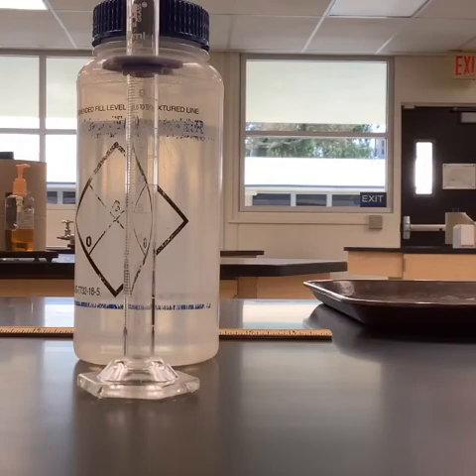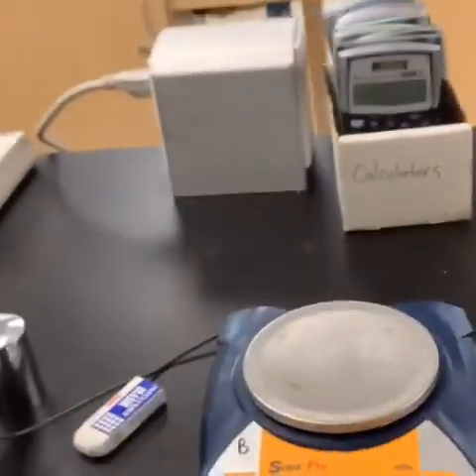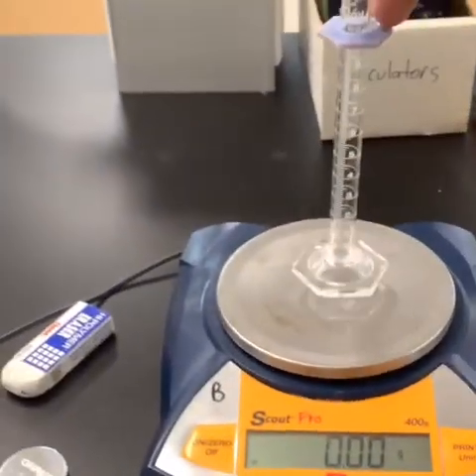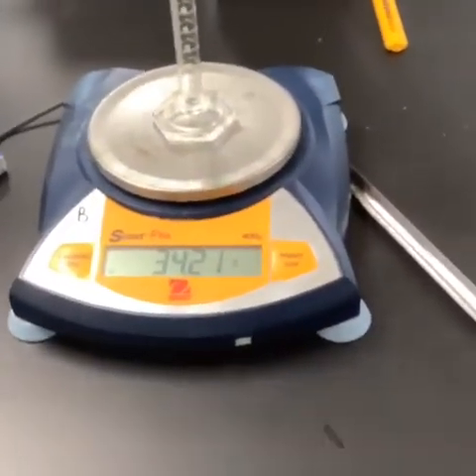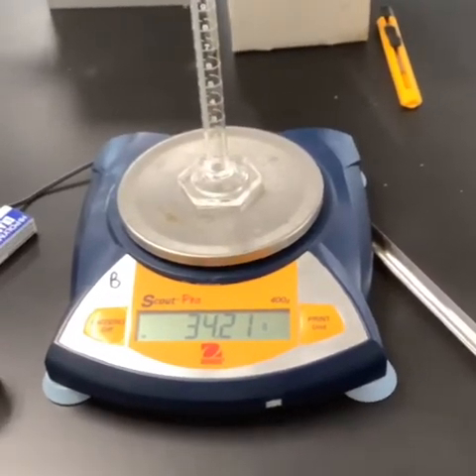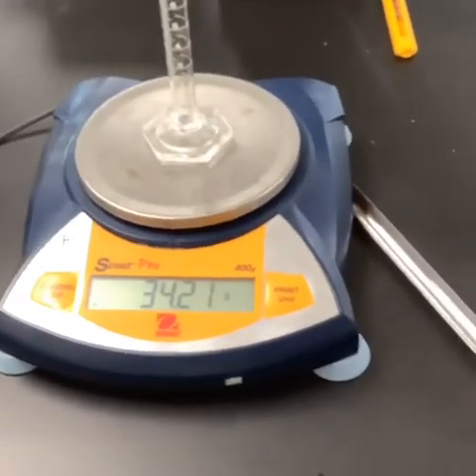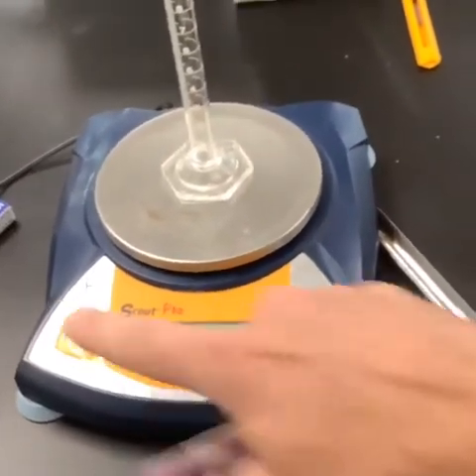So remember, we have a couple of different ways that we can find that. We can either take the initial value of our graduated cylinder. So if I put this on the graduated cylinder, we see our initial value here. Or I can tare it. So right now we're reading 34.21, which is the mass of our cylinder. I'm going to clear that.